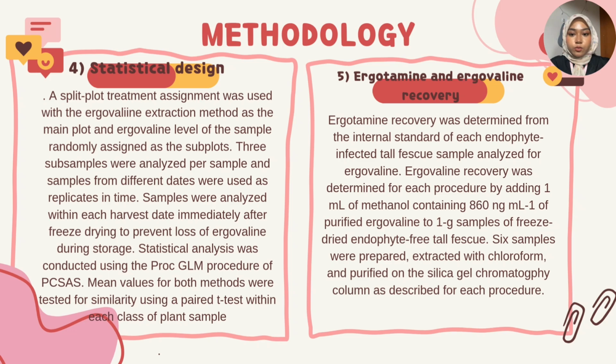Samples were analysed within each harvest date immediately after freeze drying to prevent loss of ergovaline during storage. Statistical analysis was conducted using the PROC GLM procedure of PC SAS. Mean values for both methods were tested for similarity using the paired t-test within each class of plant sample.